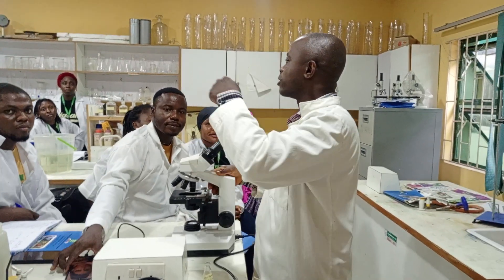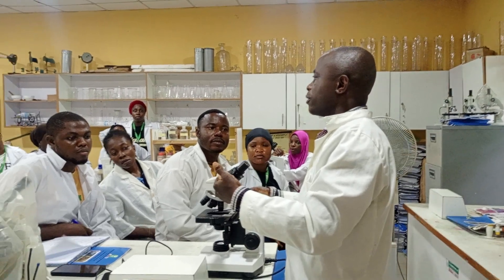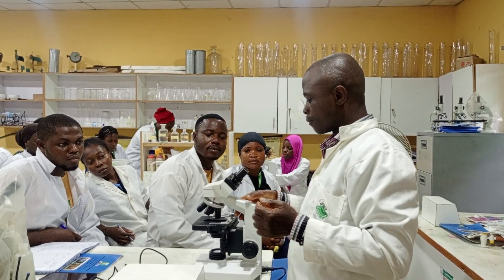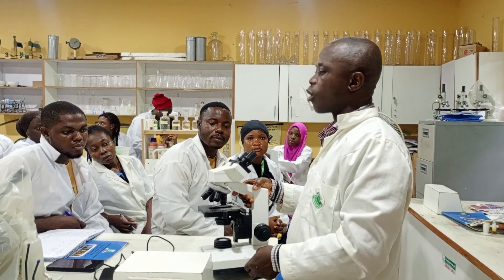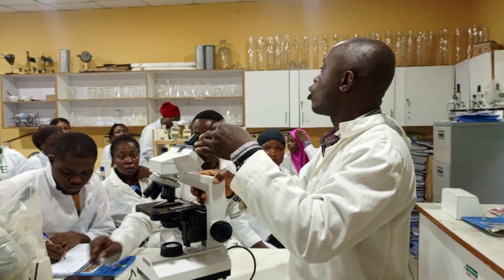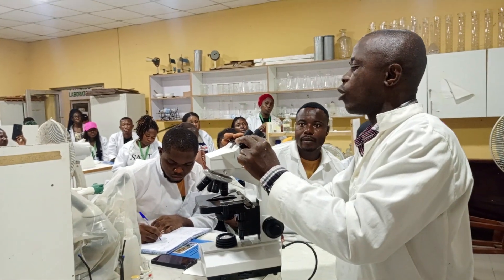Today we are going to be talking about how to bring a microscope to focus — specifically, how to bring a specimen to focus under the microscope. This is a microscope; we call it a light microscope. It's also a binocular microscope because it has two oculars, two eyepieces.